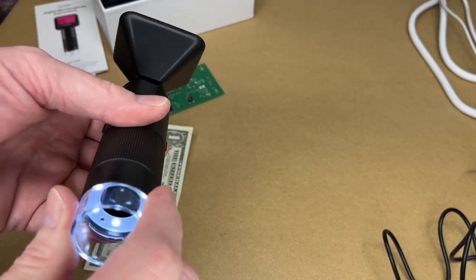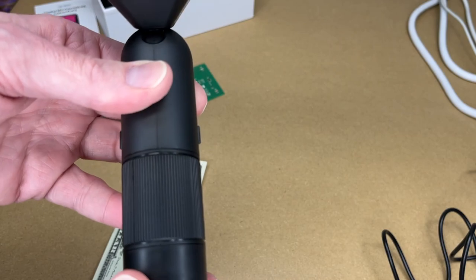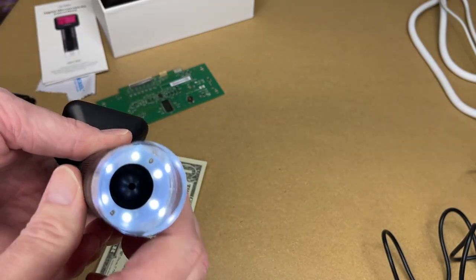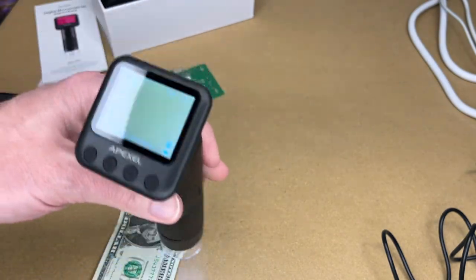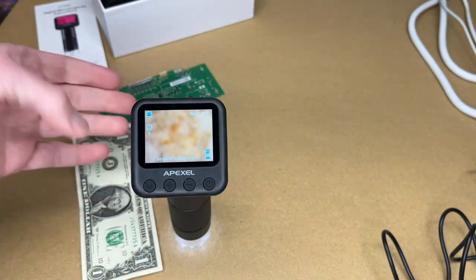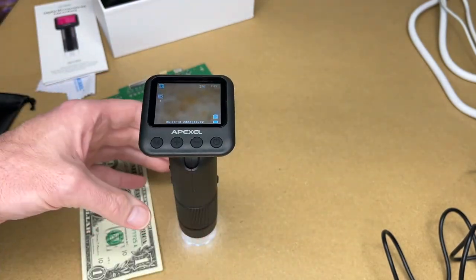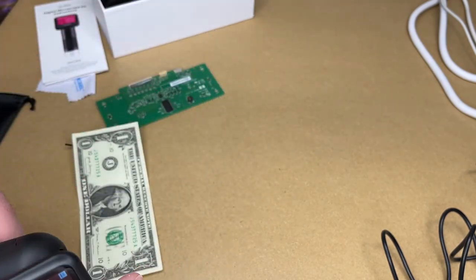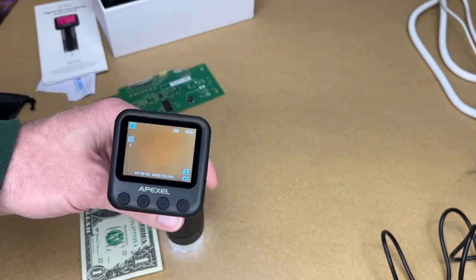If you're a teacher, you could connect this to a computer and display it on a projector. Let's take a quick look at the bottom. These are the LED lights and the lens. This plastic cover will come off, but you'll probably want to leave it on because it sets the focal distance. When I rotate the focus ring you can see the lens move up and down. It's super easy to hold, and I like that it's balanced so it will sit on a table. It's slightly more stable with the screen facing up.